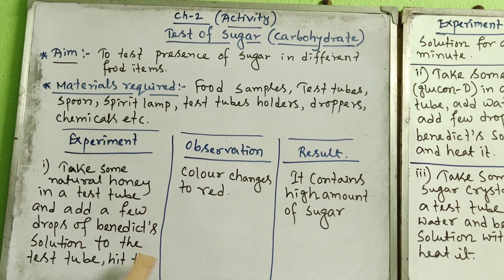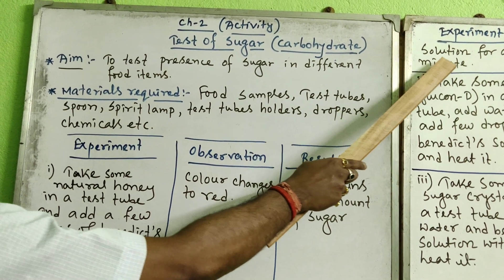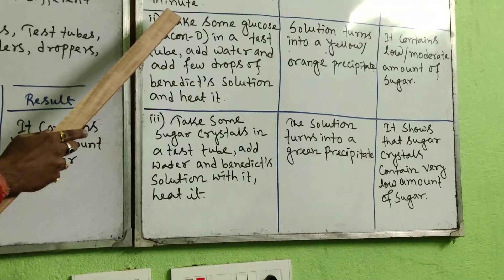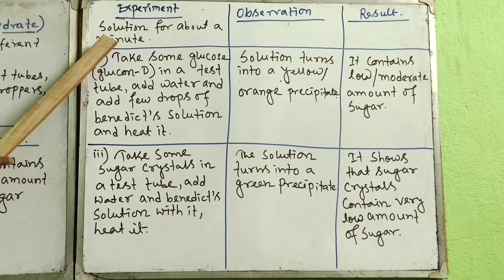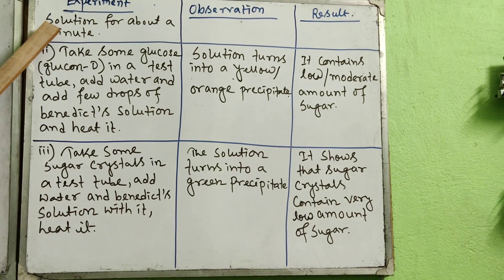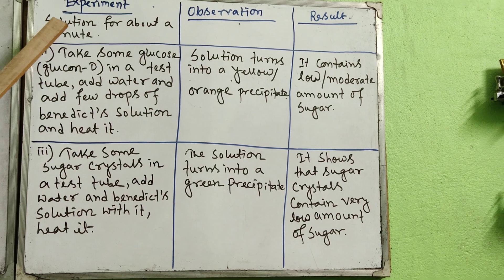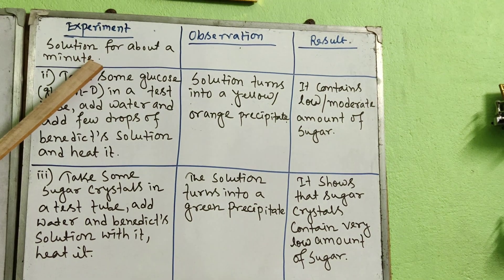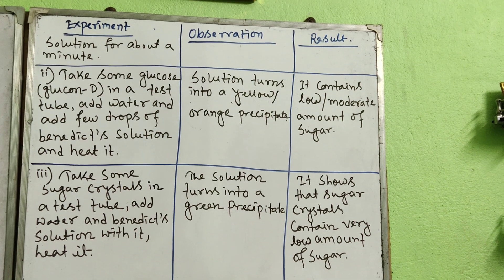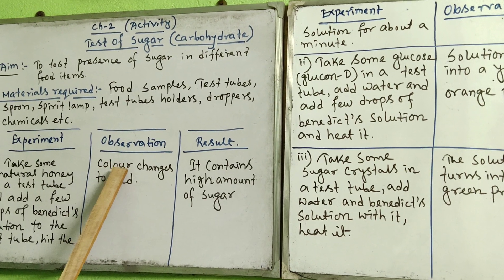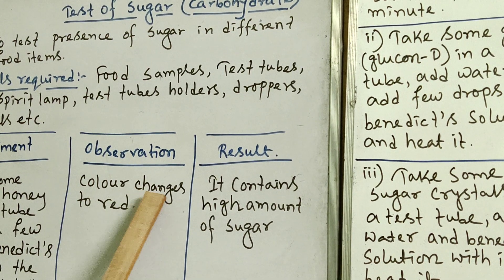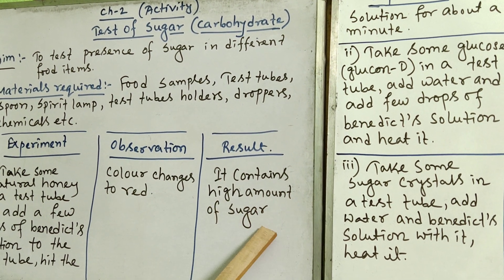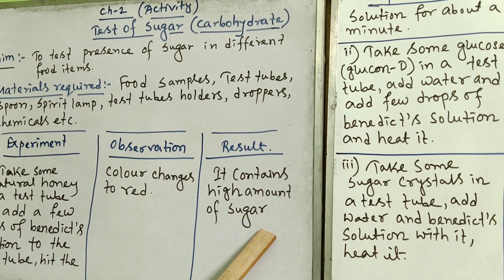First experiment: Take some natural honey in a test tube and add a few drops of Benedict solution to it, then heat the solution for about a minute. Benedict solution will be explained during the lab or in this video. After one or two minutes, observe the color change. If the color changes to red, it confirms that honey contains a high amount of sugar.